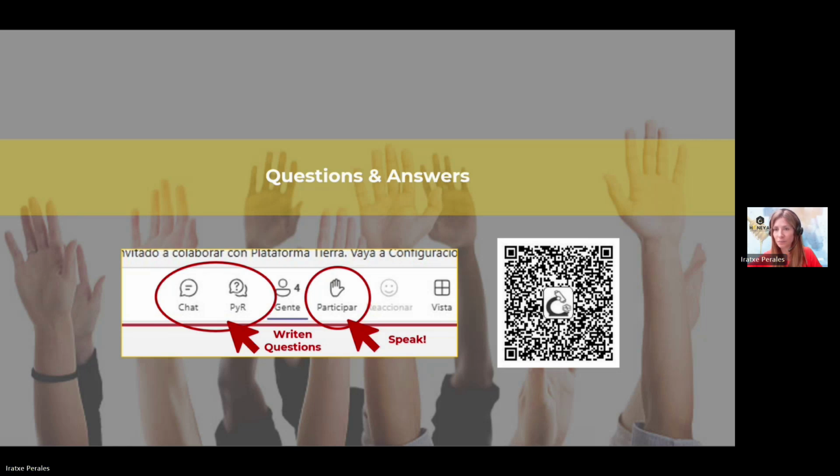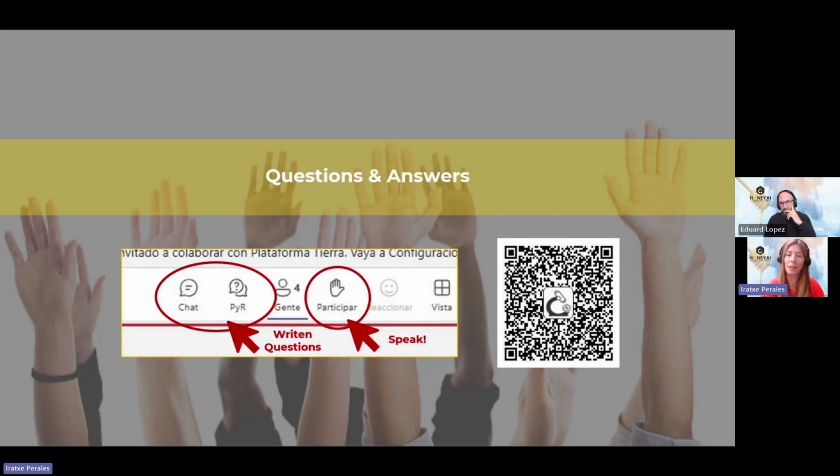For the starch content, the quantification is like yeast. We can cover it, because we count the number of fields and we know how many grams of honey you add, so we can estimate the composition and the concentration. If you want to know the ranges that we use, you can go directly to our website, to technology, pollen analysis, and you will see the ranges there.